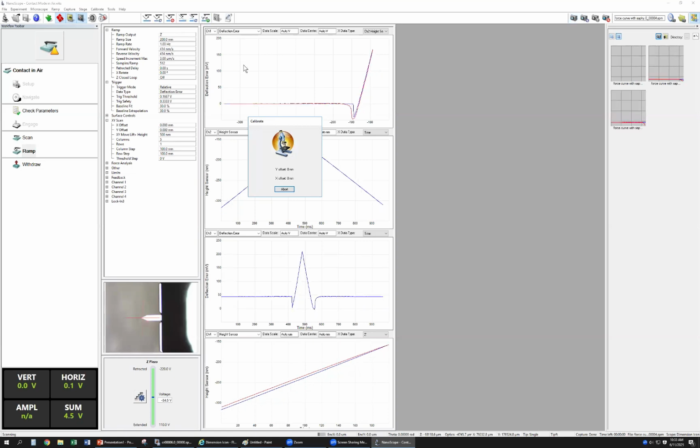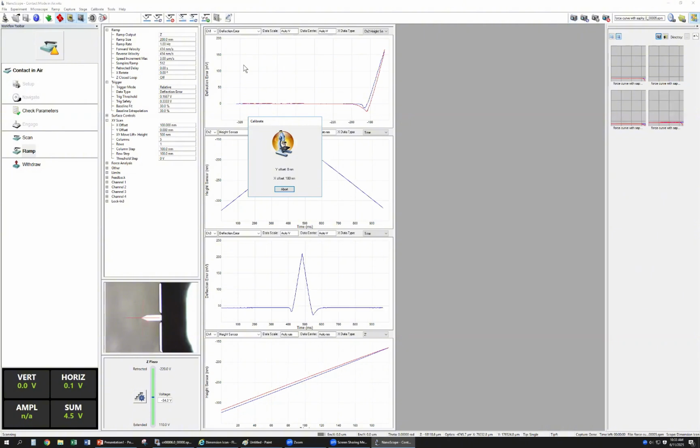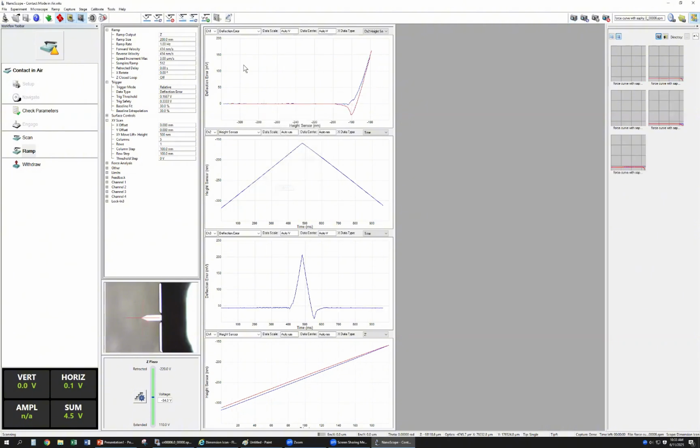So you see, like this kind of image, we cannot use it because here has some loss, some pore loss. Okay, so that means some areas maybe dirty. Okay. So which kind of force curve is better? Let me use the better one.